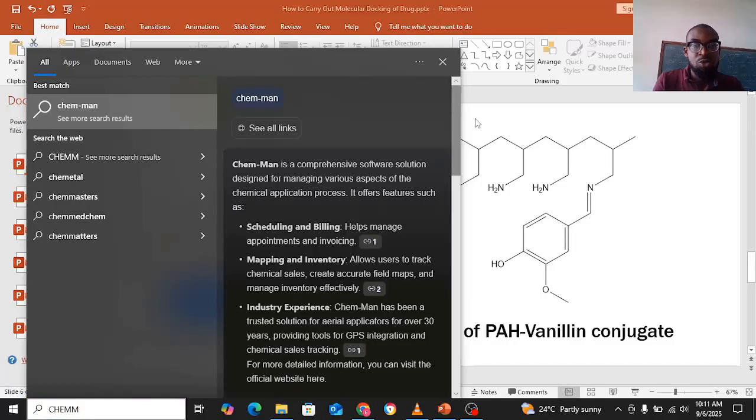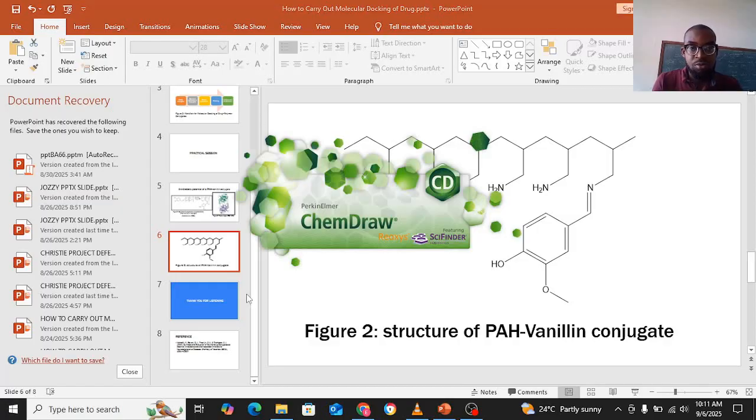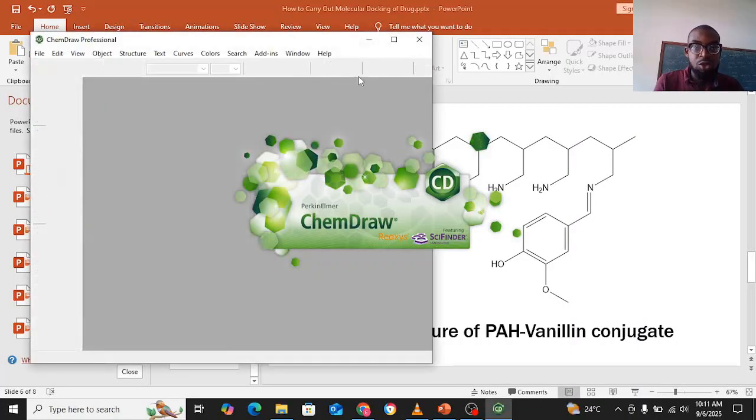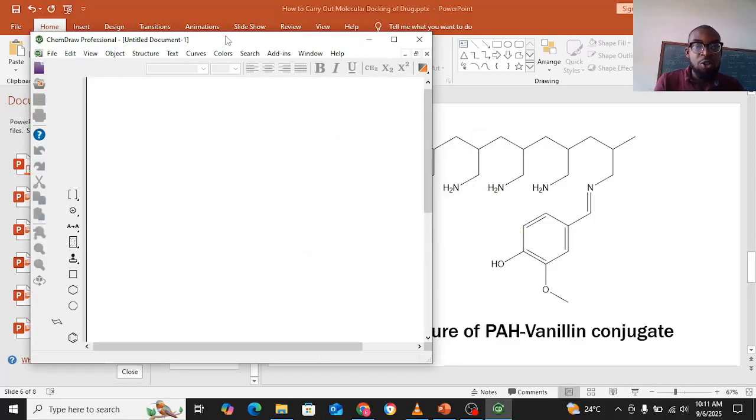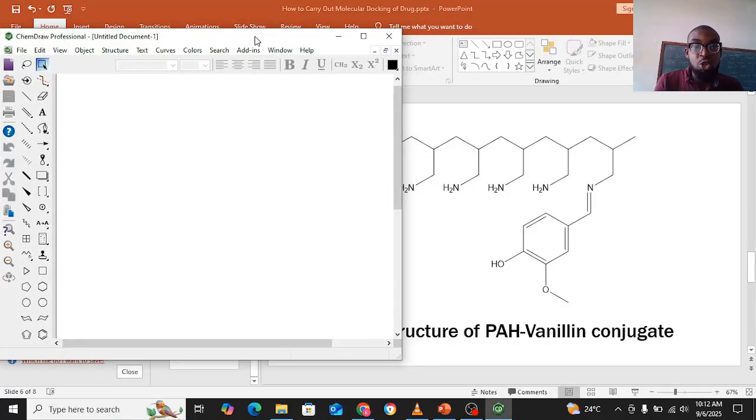Now, we have ChemDraw here. Okay, so this is good. So the first thing I will do is to draw this structure.